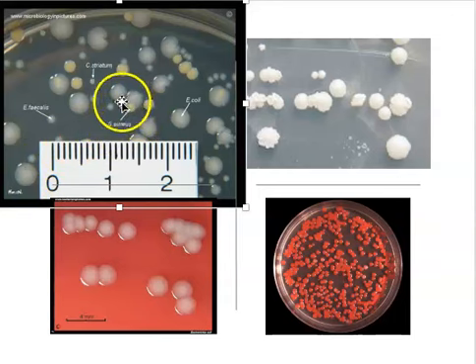There's Staph aureus, that's the yellow one. E. coli, that's this one. There's Enterococcus faecalis, that's the little one. When you have different types of bacteria growing on a plate, you often see different colony morphology as well. And that's quite helpful if we're looking at an environmental sample that has multiple types of bacteria in it.